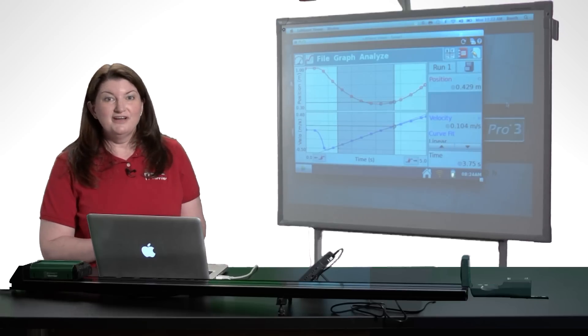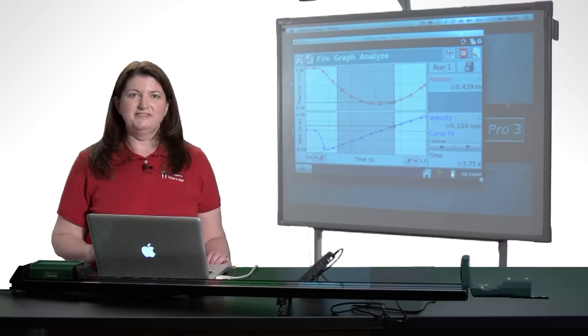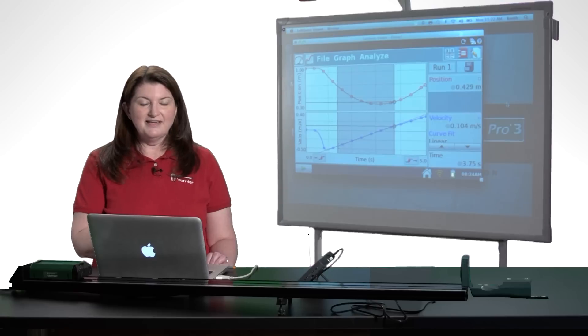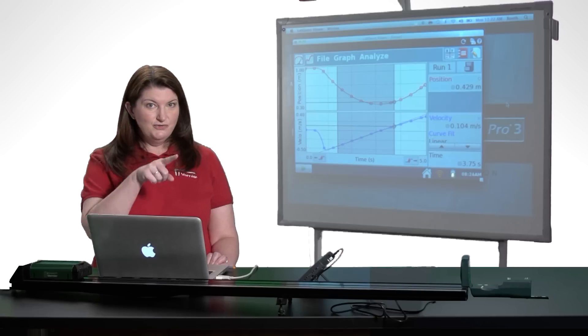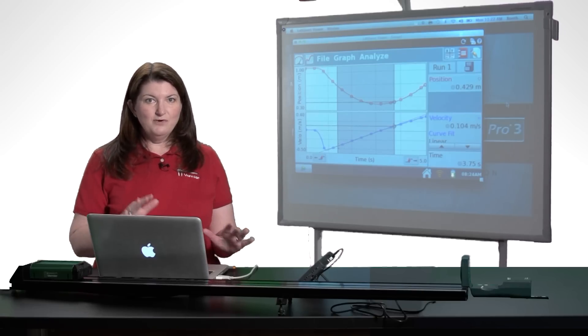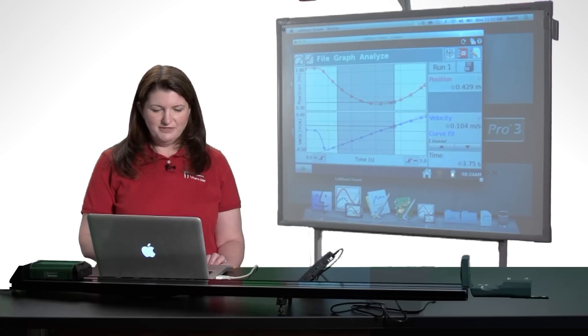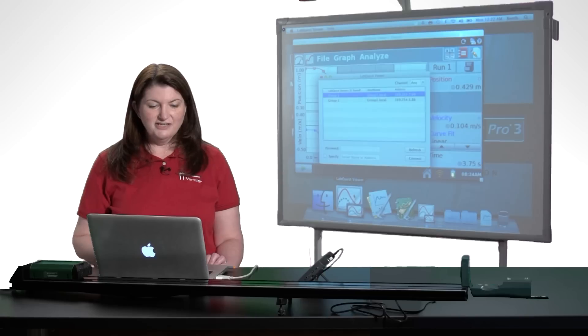Now another nice feature of the LabQuest viewer is that you can look at more than one LabQuest at a time. I've been looking at the LabQuest that I have running here, but student group number two across the room has been doing the exact same experiment. I want to show their data to the rest of the class. So I just go back to my LabQuest viewer software and launch another copy.